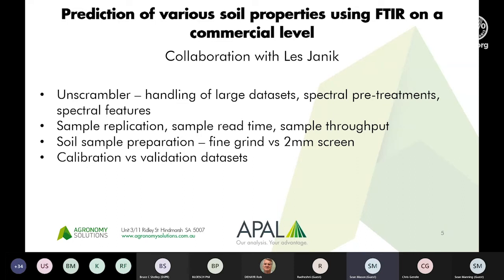Obviously, spectral pre-treatments, there's a lot of them. Les has got a lot of experience in that, so which one was best for routine quick analysis, spectral handling, and the spectral features we know about being IR experts. Something at the lab level we've touched on.